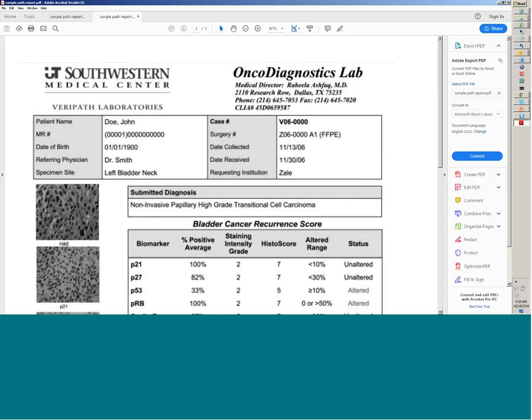So here is the pathology report, and it's got the patient name right on it. We cannot have the patient name, their medical records number from the hospital. We can't have their social security number, even their phone number. It's perfectly fine for their date of birth and for their gender and their physician and all of the other data relevant to the pathology report. The protected health information data that I mentioned first needs to be redacted from the report. So we have a procedure we'd like you to follow for doing that redaction.